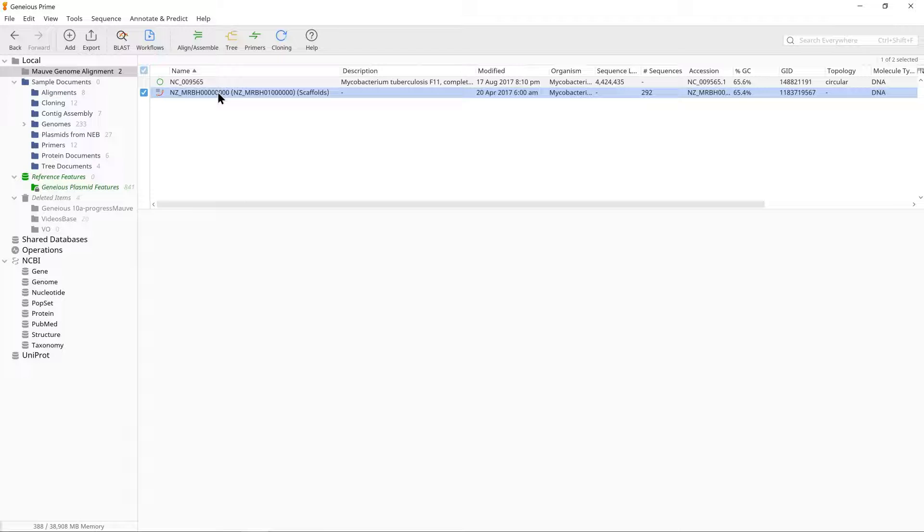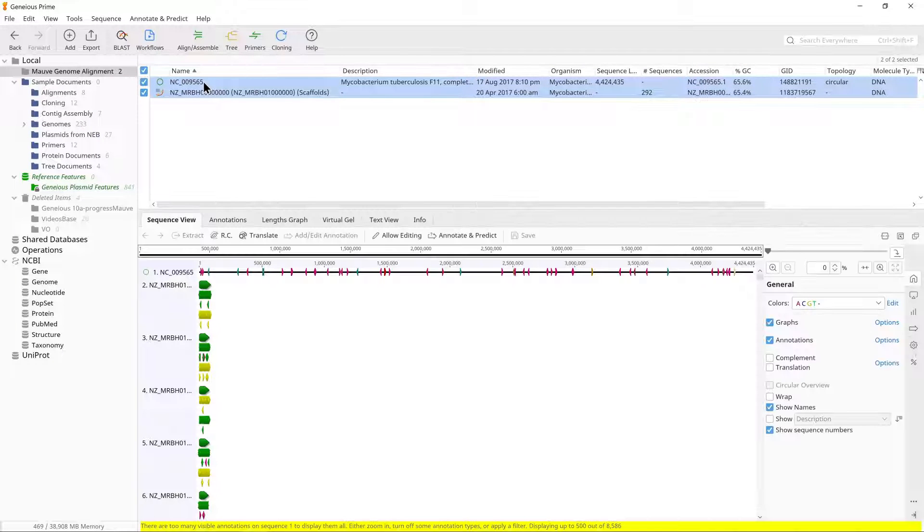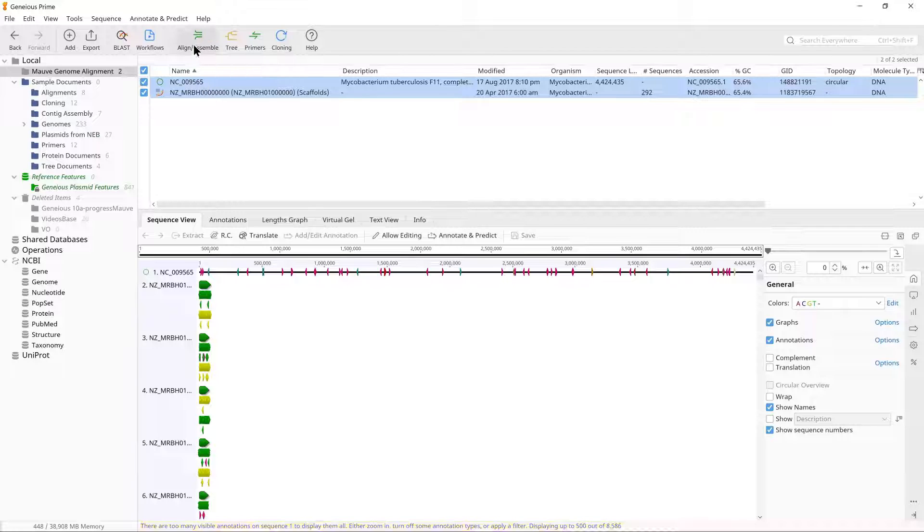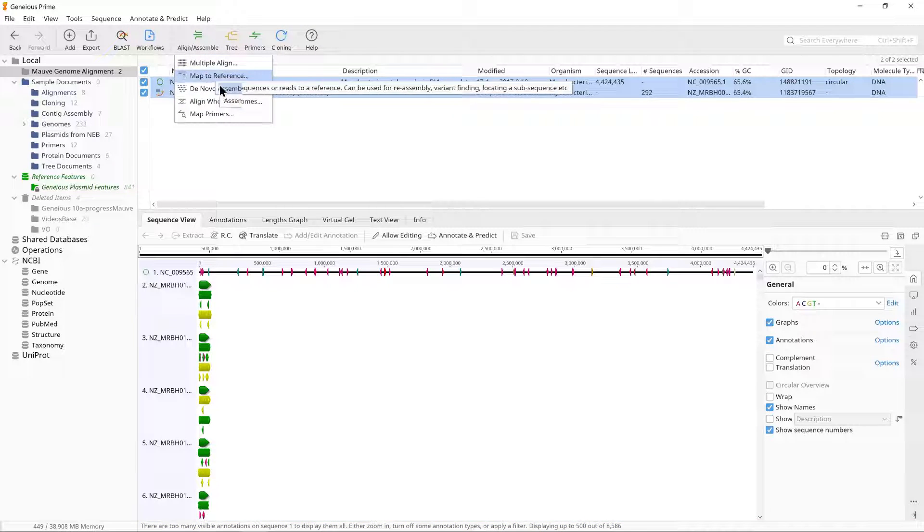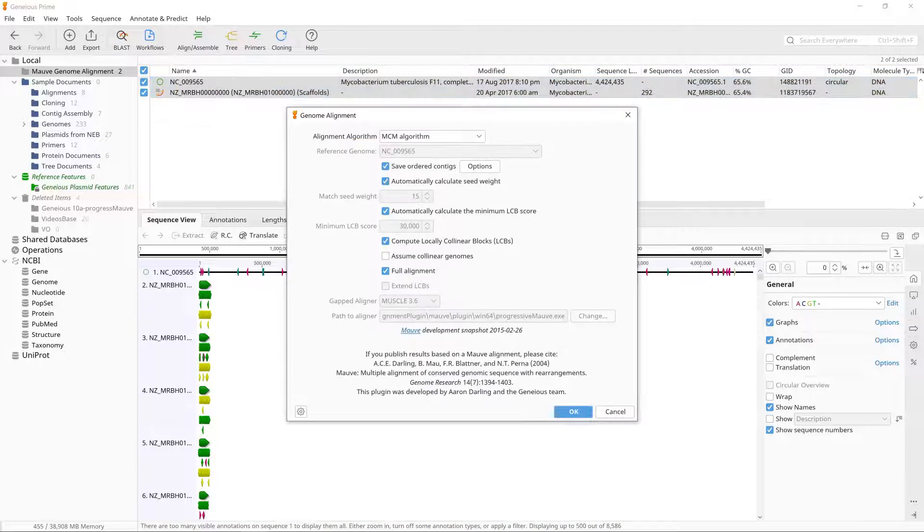Select the draft genome and the reference genome NC_009565. Then go to Align, Assemble, Align whole genomes.